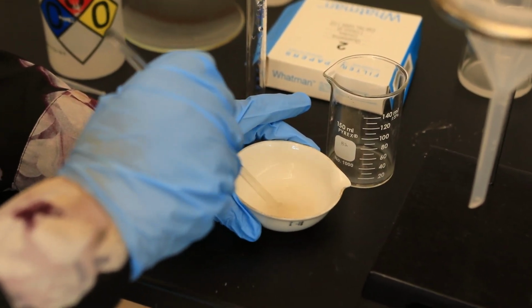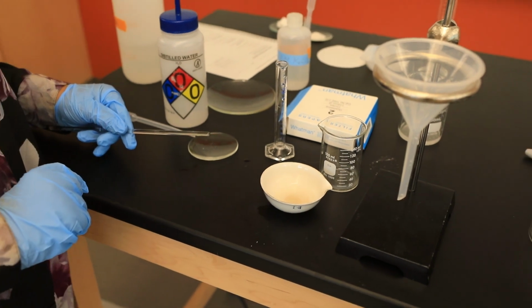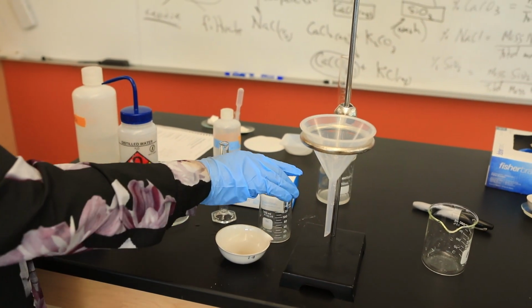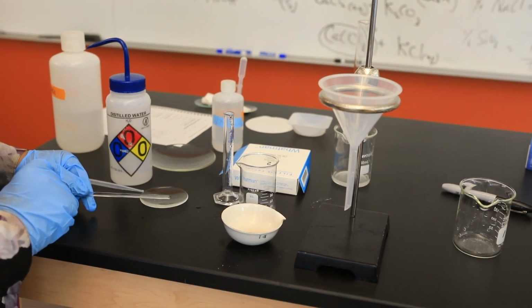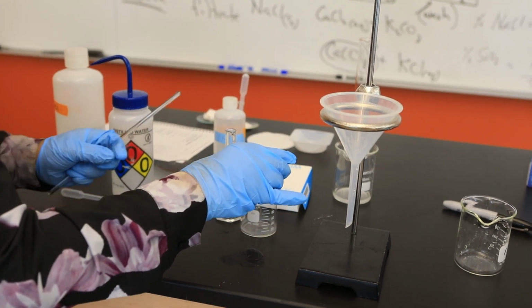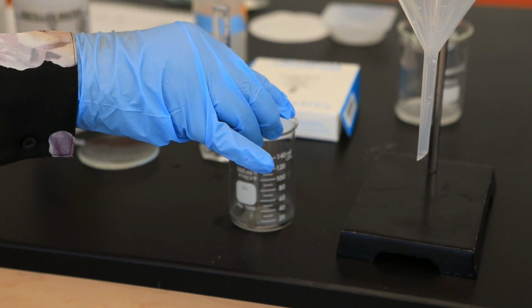So again, I'm going to allow this to settle. I'm going to pour that solution off. I'm going to remove that solution by decantation. And inside my evaporating dish will just be the sand, and inside my beaker here will be my solution of calcium chloride. Alrighty, so here we go. Now that it's settled, I'm going to slowly pour off my calcium chloride solution. Hopefully you can all see this.